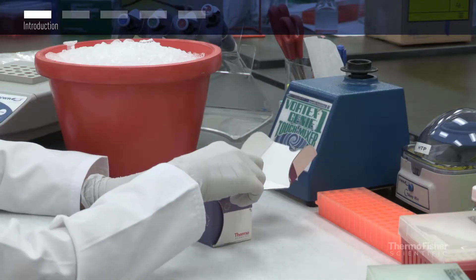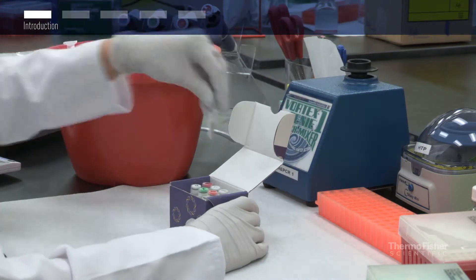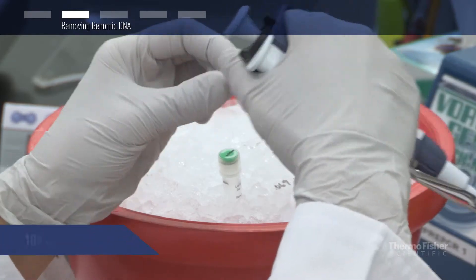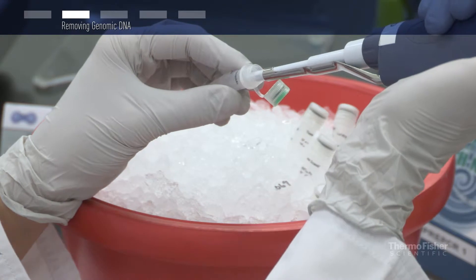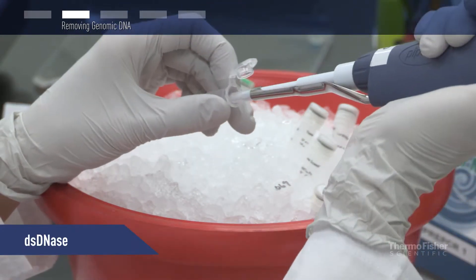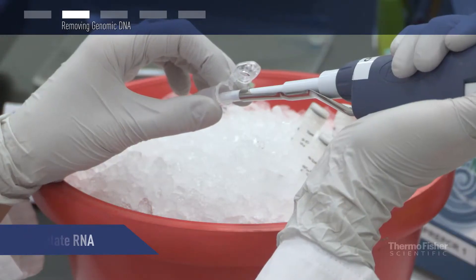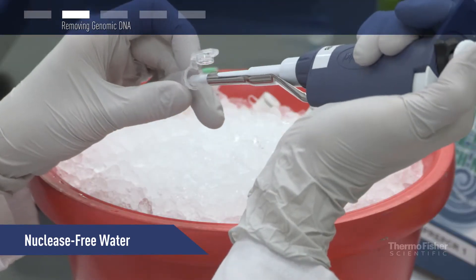You'll want to wear gloves when working with RNA samples to prevent contamination with RNases from your skin. To remove genomic DNA from the RNA sample, add the dsDNase buffer, dsDNase enzyme, template RNA, and nuclease-free water to a sterile RNase-free tube on ice.